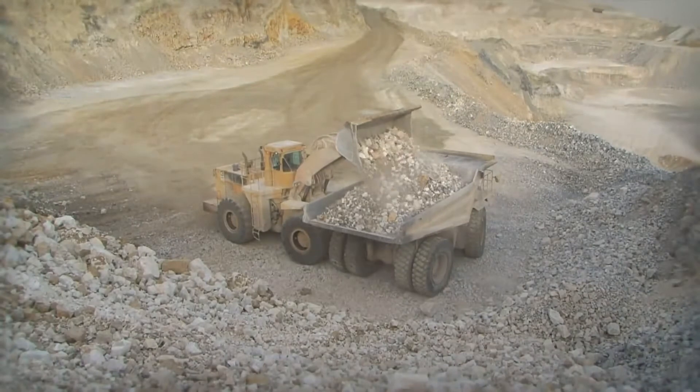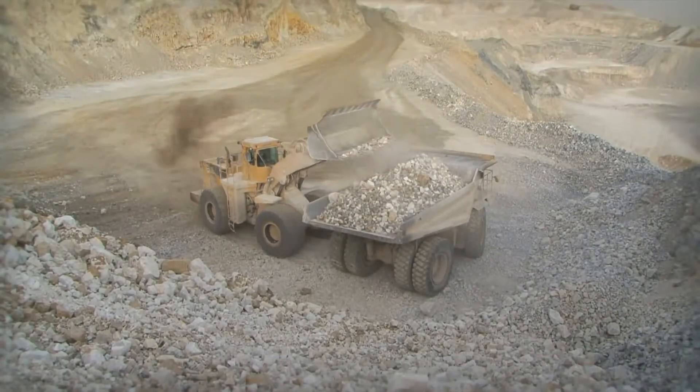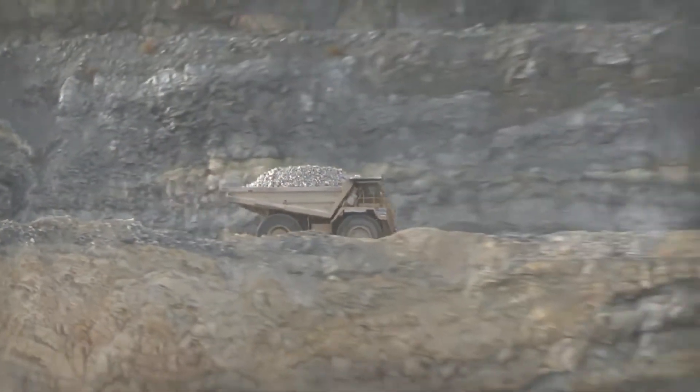Today's cement producers are under pressure to make high-quality cement in high volumes while closely controlling waste, cost, and environmental impact.